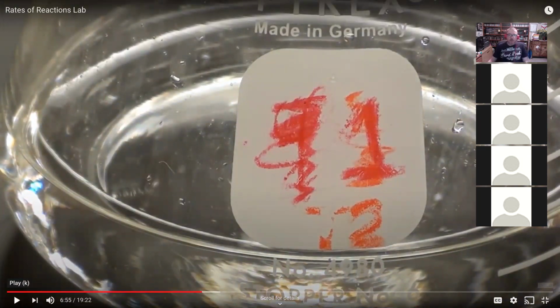What we're looking at there is the disappearance of the iodine. It has that concentration at the beginning, once it's put into the flask, and then it goes down to zero. That's the change we're talking about: the change from the diluted iodine initial sample all the way down to zero. Because once it's no longer colored, there's no longer any iodine present. So that's what the timing is representing here.